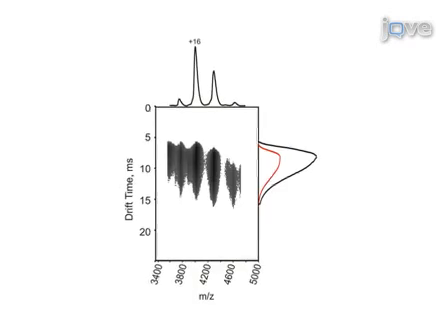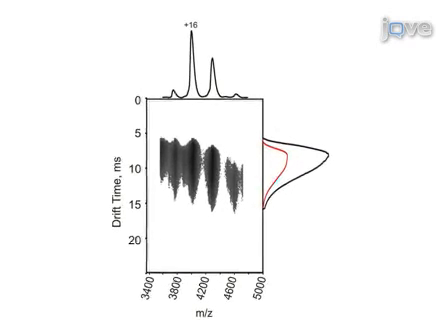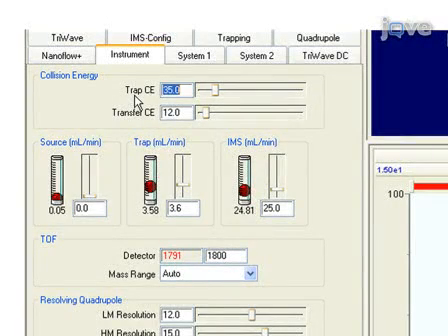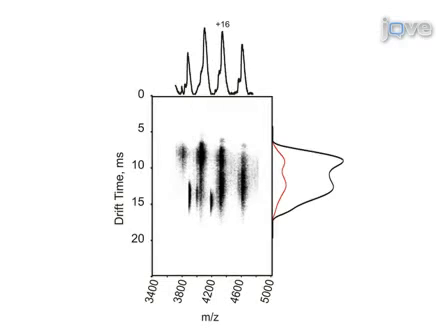To ensure that data acquisition is performed under conditions which maintain the native structure of the complex, it is important to collect data over a range of experimental and solution conditions, rather than adhere to a single optimized set of parameters. For that reason, increase the trap collision voltage in a stepwise manner, and acquire data at 10-volt intervals while monitoring the effect on the ion mobility profile.